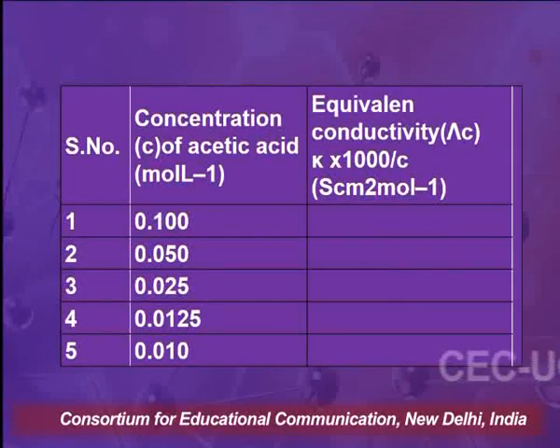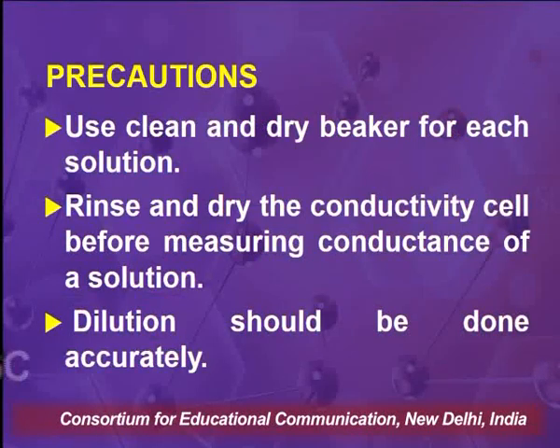Precautions: use a clean and dry beaker for each solution. Rinse and dry the conductivity cell before measuring the conductance of a solution. Dilution should be done accurately.